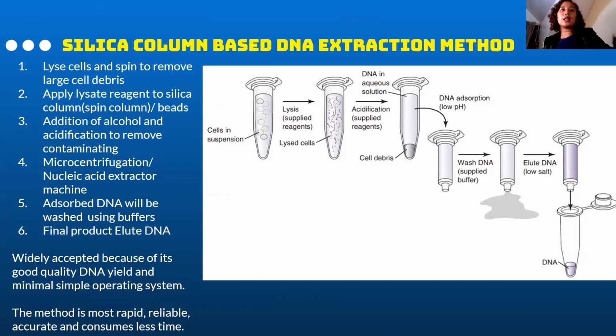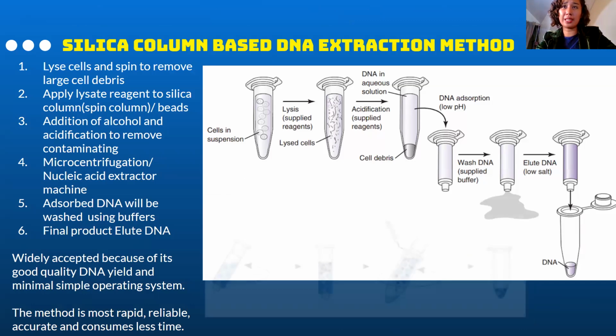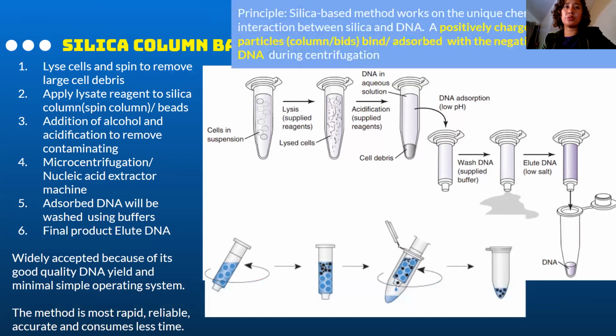So, next is silica-based. So, the gist of this, guys, is DNA is attracted to silica. Kumakapit siya sa silica. And so, silica-based method works on the unique chemistry between silica and DNA. Silica is positively charged and it binds or adsorbs the DNA. So, the word is adsorb, with your negatively charged DNA.